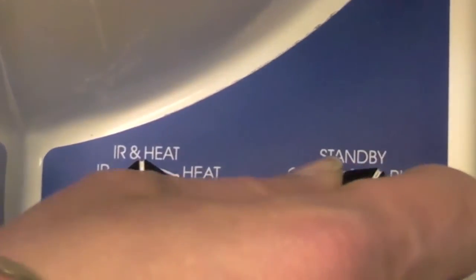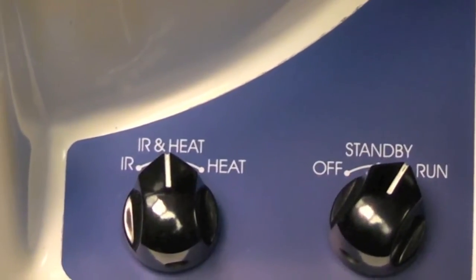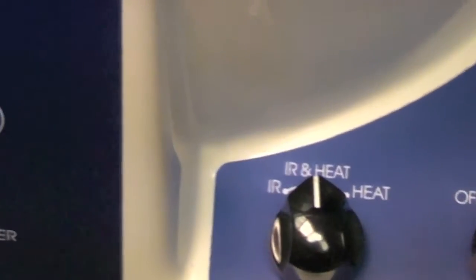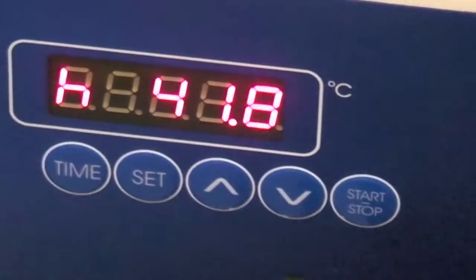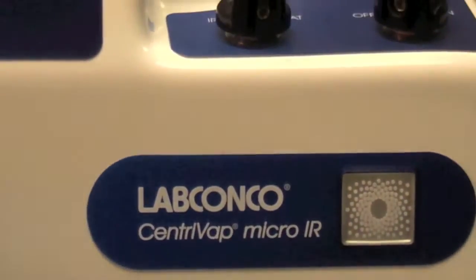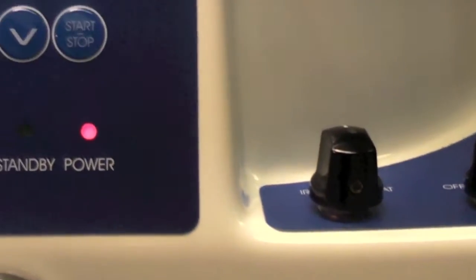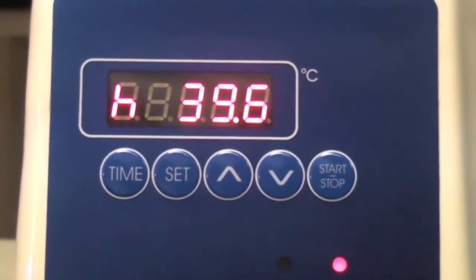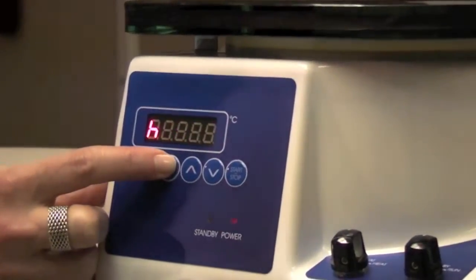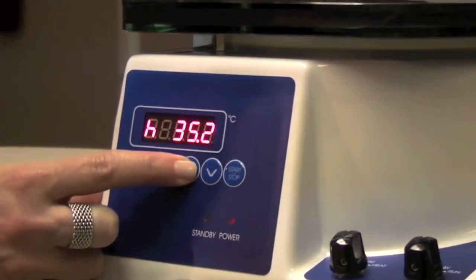The microprocessor-controlled 300-watt heater speeds evaporation by supplying a controlled amount of heat from 35 degrees Celsius to 65 degrees Celsius in 0.1 degree increments. The LCD prompts the user to set heat and time.